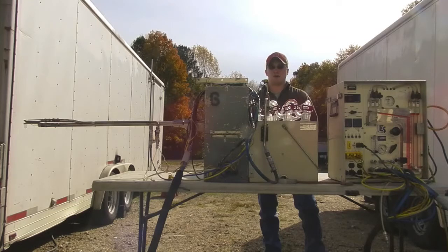This is the standard Method 5 setup for the isokinetic sampling of a stationary source, such as a smokestack or air duct. Method 5 is used to gain data as to the source's particulate emissions, although we also collect data regarding its volumetric flow rate and moisture composition.